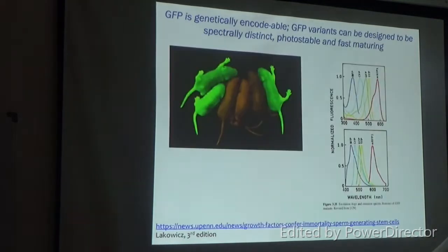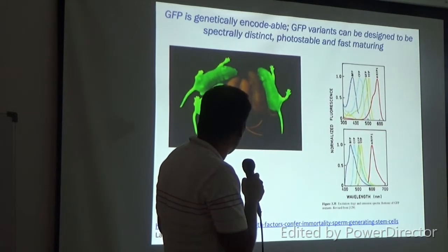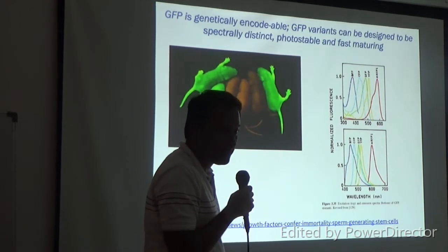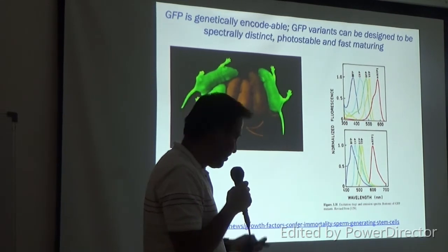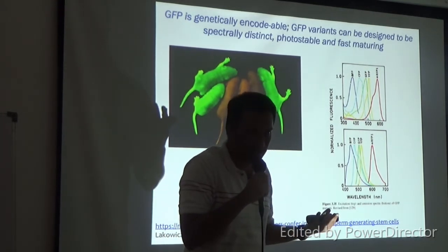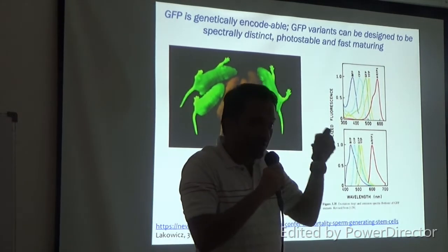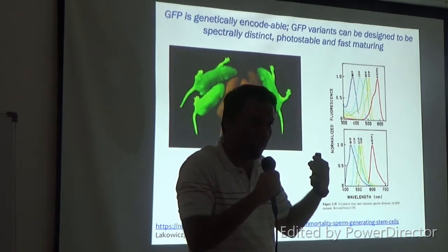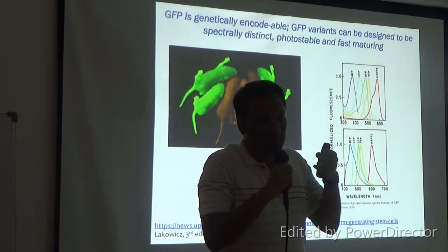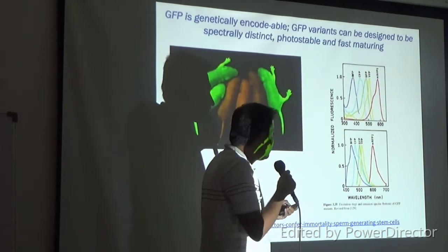So this is what we were talking about. We have taken this GFP protein. Here are three mice which are expressing this GFP, and here are three mice which are not expressing this GFP. You have illuminated them with UV light, and you can clearly see that these three mice are glowing green, right? The objective is not to make green mice. The objective is to take our protein of interest, fuse it with GFP, and then, as you saw in that movie of the EB1 or the movie of the microtubules, to actually see dynamics in cells, and perhaps to see localization in the organism, right?